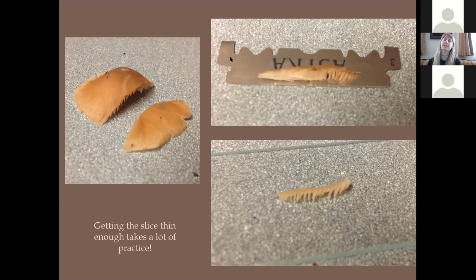And then you take another razor blade and stack it on top of that, and then wrap it around the entire two razor blades so that there is a tape's width of space between the two razor blades.